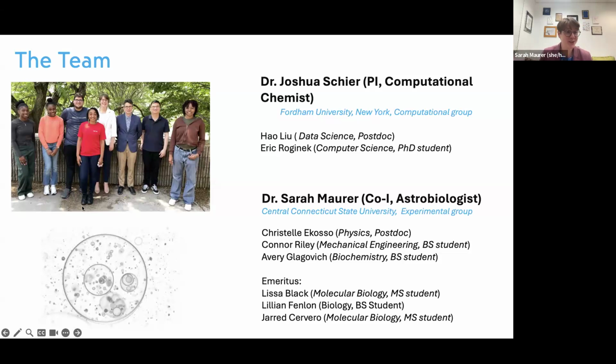One of the really interesting things that has come out of this is, if you can see this vesicle here below, this is from our confocal. This vesicle is like 95 microns in diameter. So if you could see fluorescence really easily, you might be able to see this with the naked eye, which is really, really exciting. And yeah, we have some really, really large structures present in this.